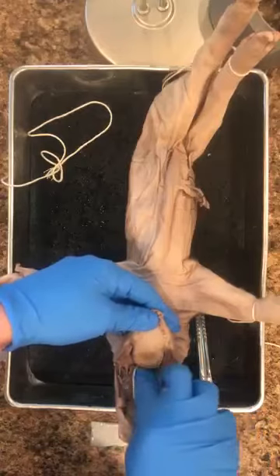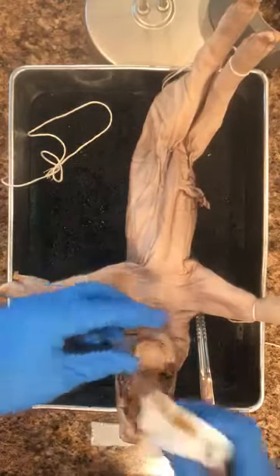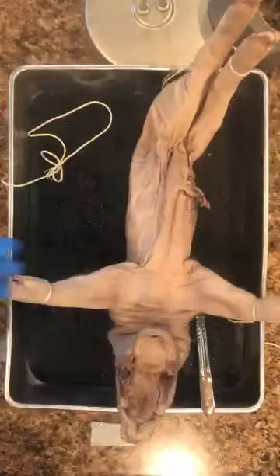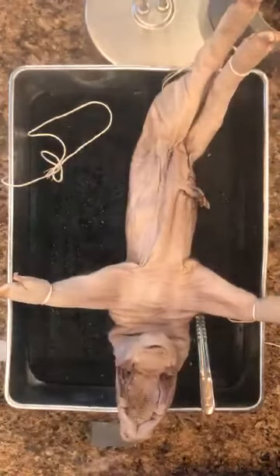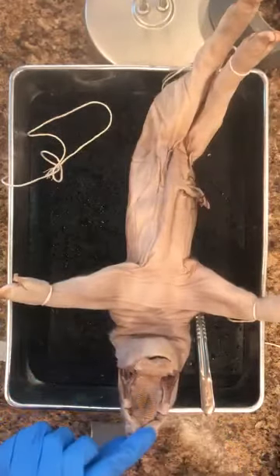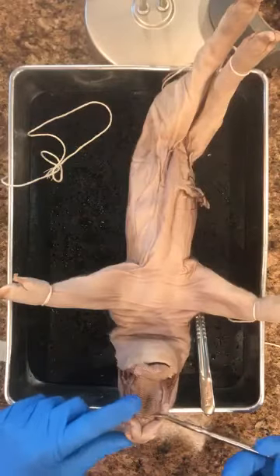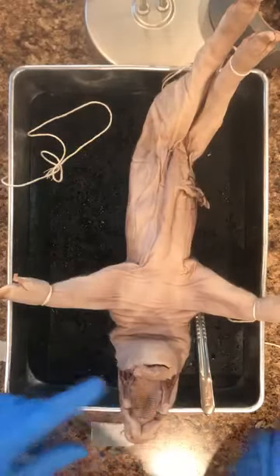Oh my goodness. Okay, I love this. Okay, a few things in the mouth I really want to point out to you here. Okay, so it has some teeth, and I'm telling you guys, these teeth are very sharp. Here are the teeth. These two in particular, very sharp. They could like rip my gloves.